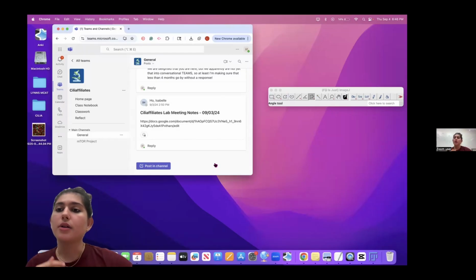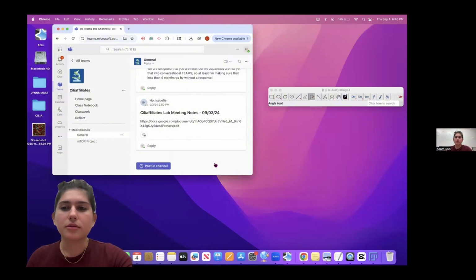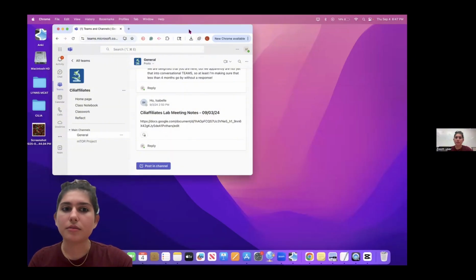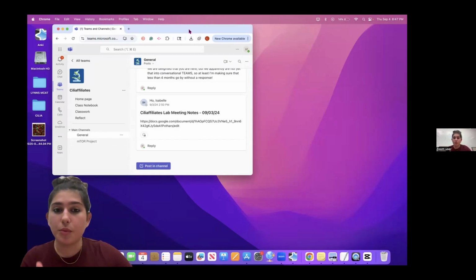I'm going to be showing y'all how to open Fiji and how to do the basics in Fiji, right? Because I know a lot of us did have trouble with it when we first started out, because I certainly did. So yeah, let's get started. Let me get rid of Fiji so I can show y'all how to do it from the beginning. You already have to have Fiji downloaded, and maybe I'll make that in another video, but if you have Fiji downloaded and you just want to open an image, I'm going to show y'all how to do that right now.